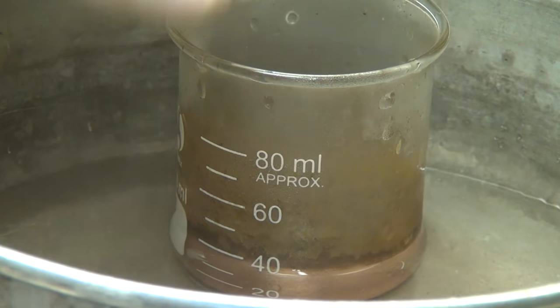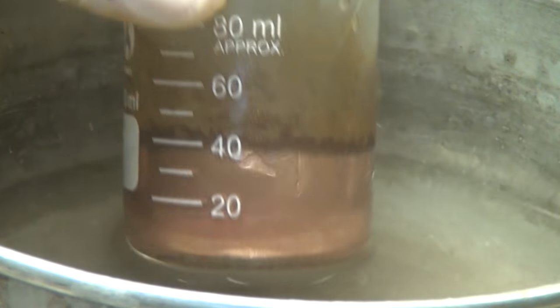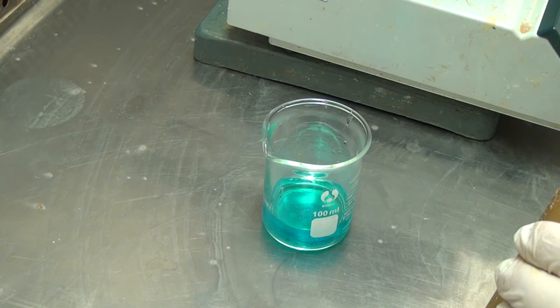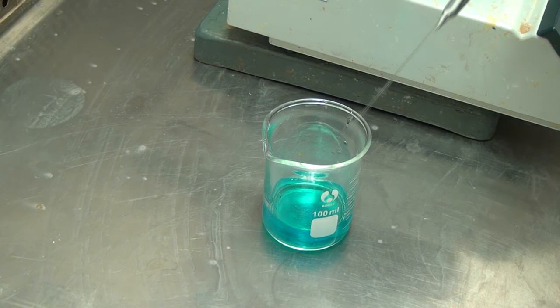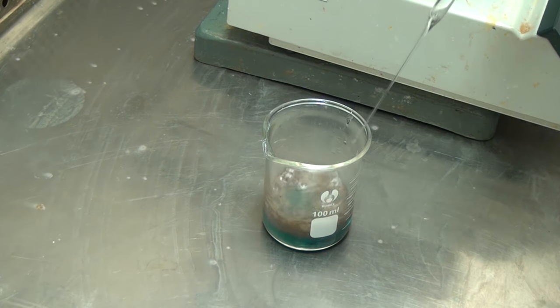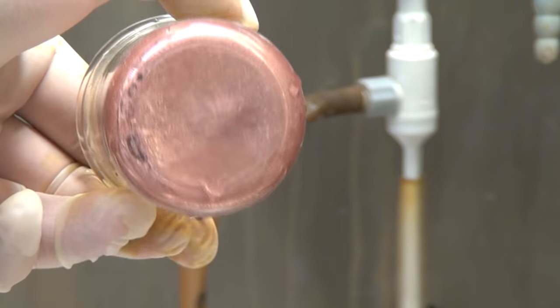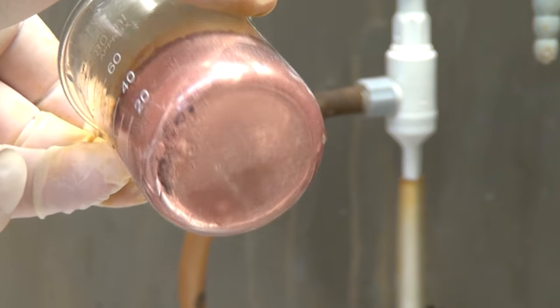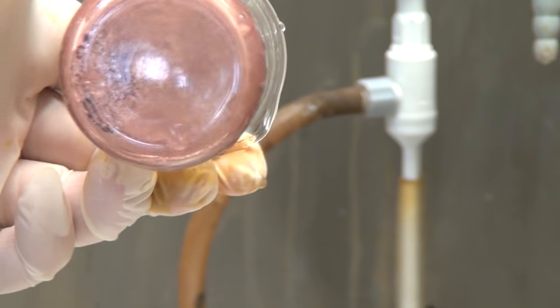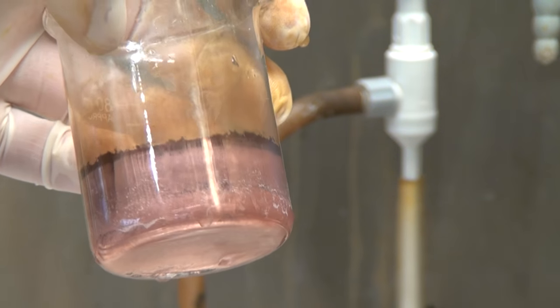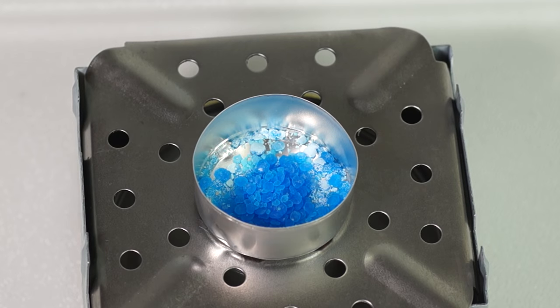There is also another interesting reaction which can be used to obtain a copper mirror. In a cup with the solution of copper sulfate, a powerful reducing agent is poured, the solution of hydrazine. The nitrogen atoms in hydrazine are being oxidized, and the copper is recovered from the solution to a metallic state, coating the walls of the glass with a sparkly, beautiful copper layer.